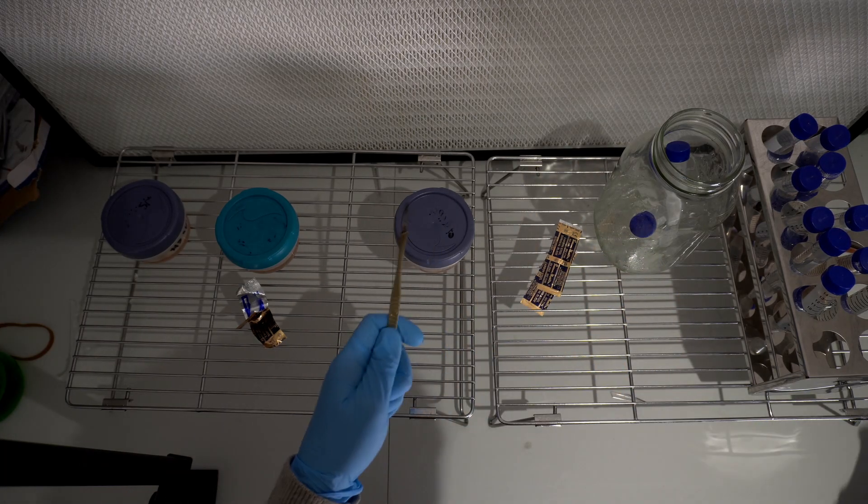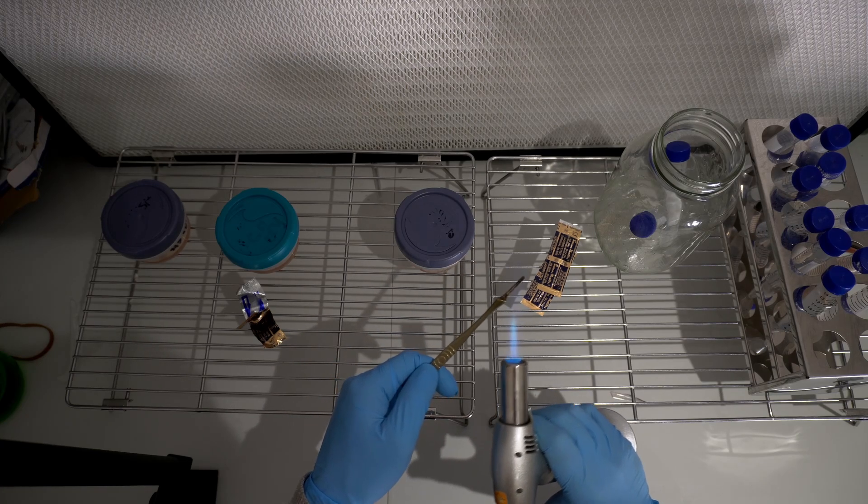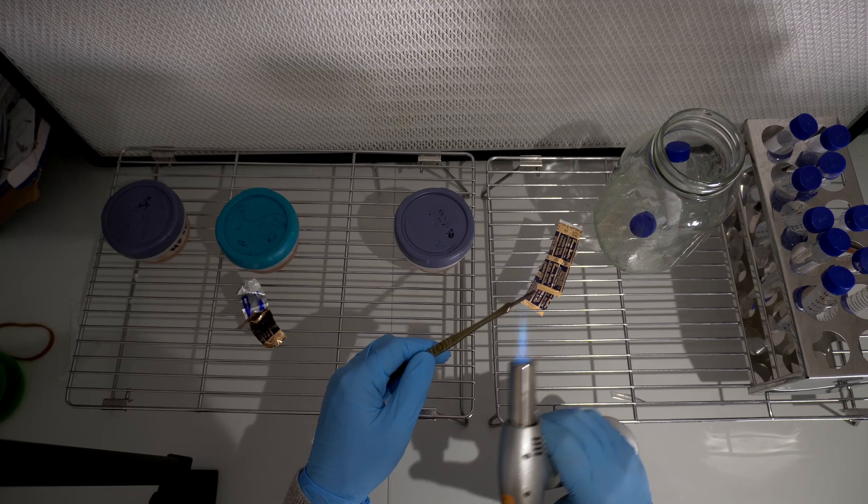Just because my hands were all over the scalpel handle there, I've decided to give it a quick flame sterilize before I put a new scalpel blade on top, because that's going to be coming in close contact with the actual culture.